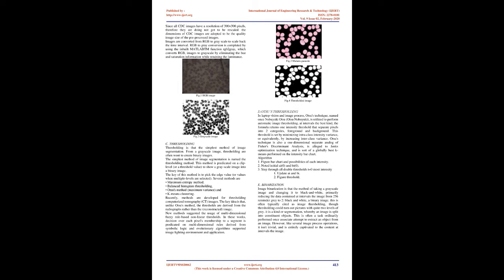Basically, there are 3 main objectives for image pre-processing. One is to resize the image for the purpose of either magnifying the image through digital zooming, or reducing the image size in order to speed up processing. The second objective of image pre-processing is to reduce or eliminate noise from the acquired image. The third objective is to enhance the image contrast for visual evaluation.